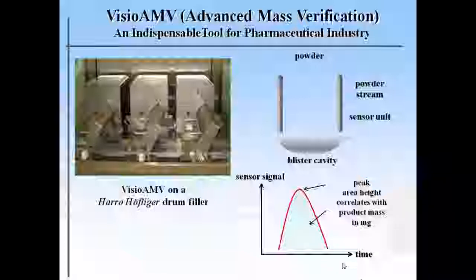But this sensor does not tell you about that. It tells you about the mass of the material and not the quality of the material. And that's why once again, I stress that the techniques we are talking about tell you something about the identity of the material.